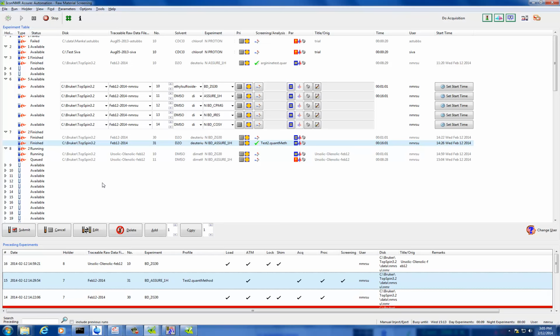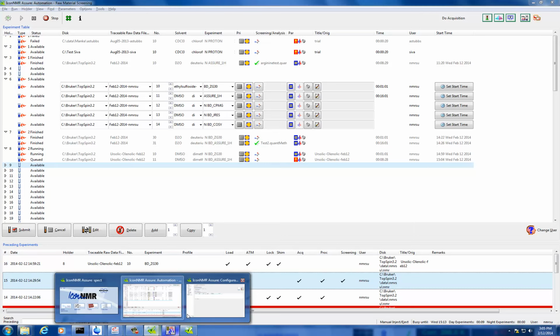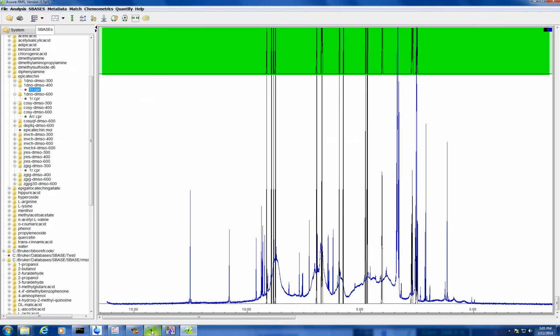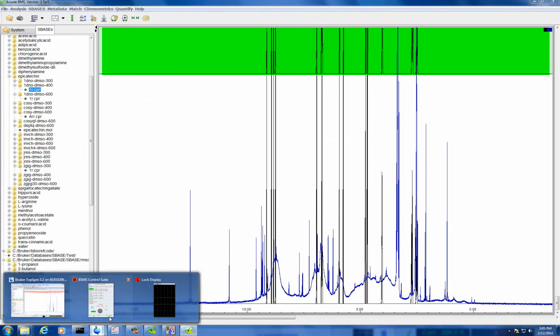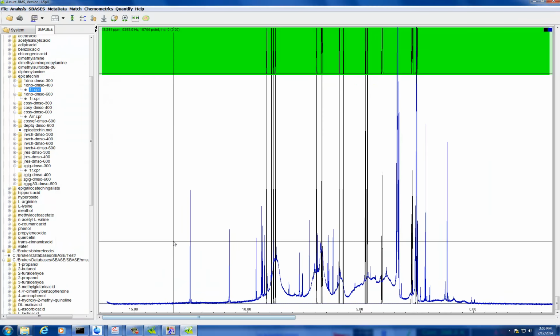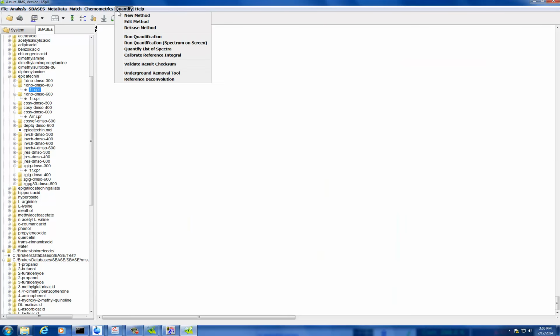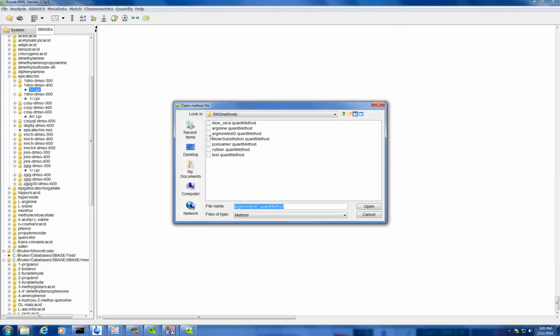We're going to do that before you guys leave, since that sample is running. Let me close this for a sec. We're going to edit test 2.